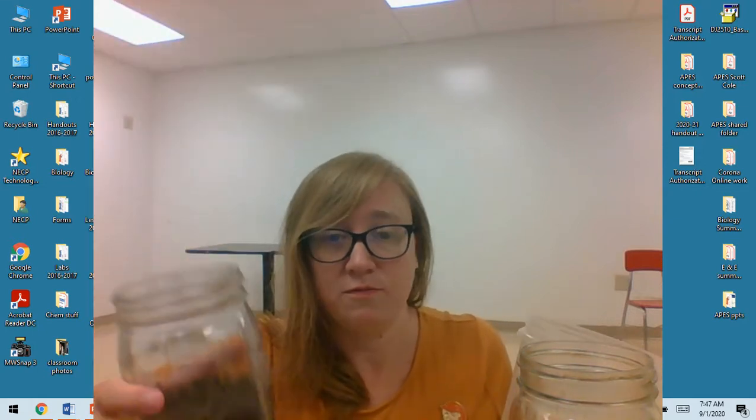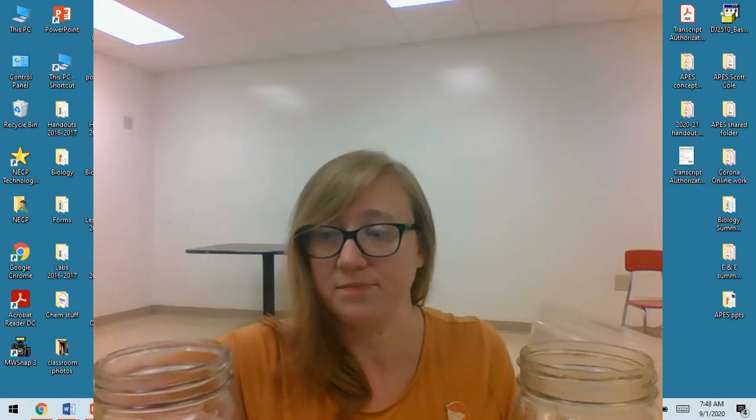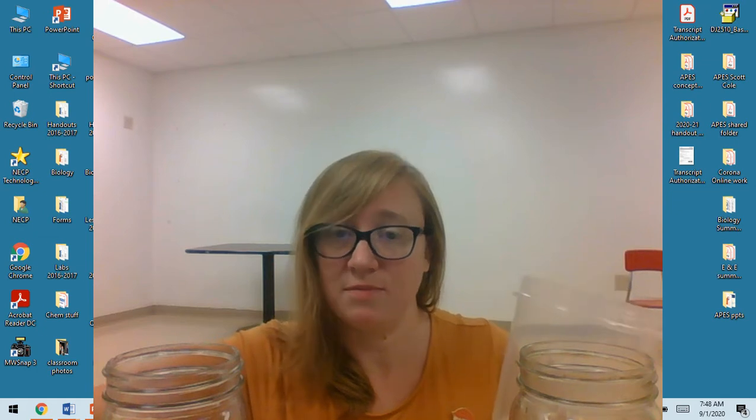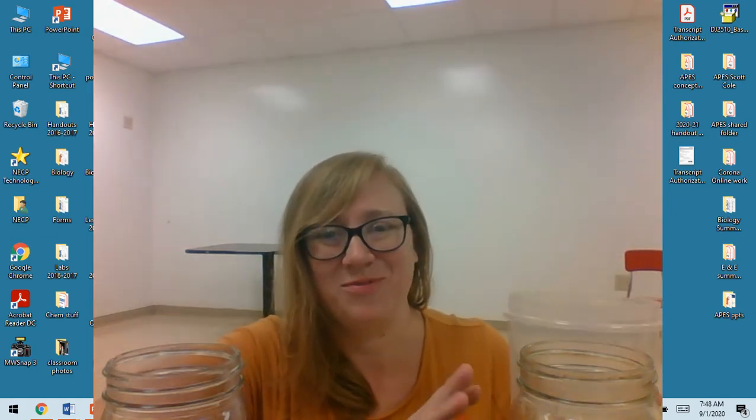So I'm going to show you, for example, if you just have a glass at home and you don't have a mason jar or a jar with a lid, I have a little Tupperware container with a lid. That's where I'm going to be mixing up my soil so I can shake it and mix it and not make a giant mess, hopefully.